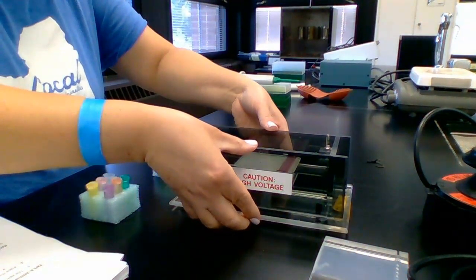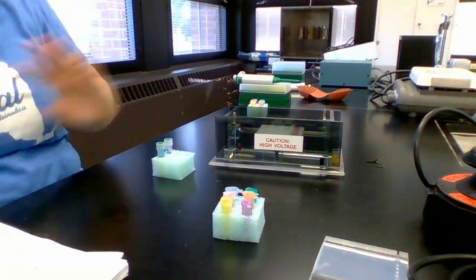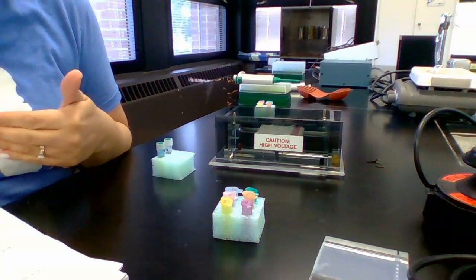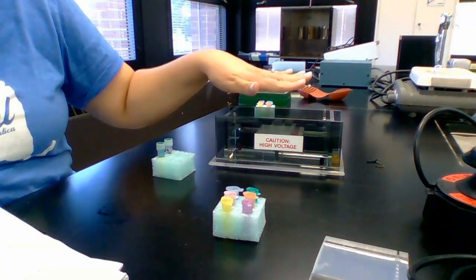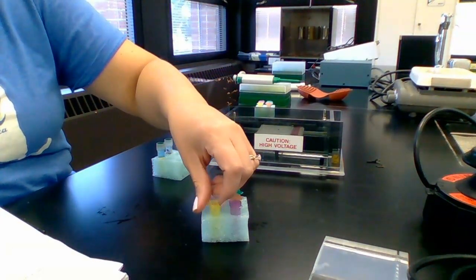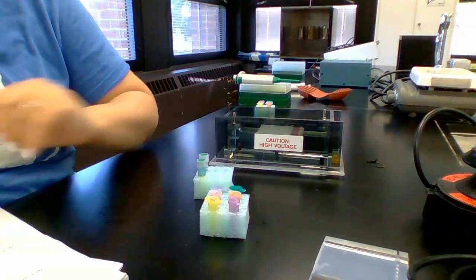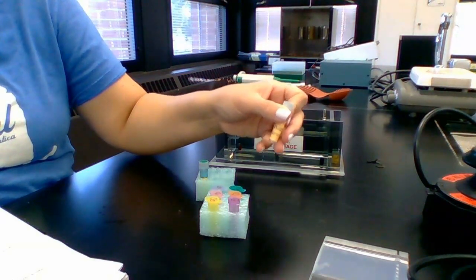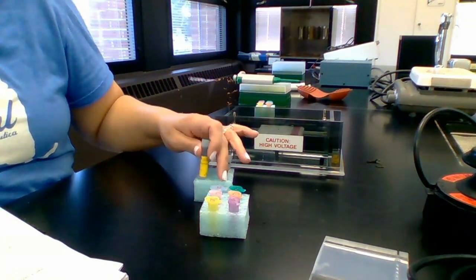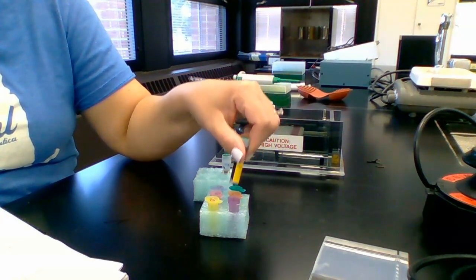Our incubation is up. I have my tubes, and I'm going to proceed with one set since everything looks good, with the backup set here just in case. We did part three, and now we're moving on to part four — preparing these samples for gel electrophoresis. Before we load them, there are a couple more things to do. The liquid in these tubes is clear and colorless — DNA is colorless, enzymes are clear in solution. What we're going to do is add loading dye to our six DNA samples. I've already added loading dye to the marker or ladder DNA going in lane one.